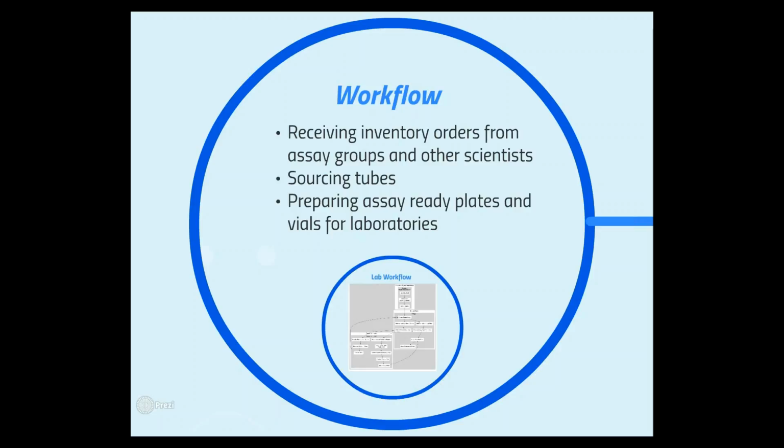We need to make sure we're sourcing the tubes from the right location, so as to optimize the turnaround time for assays, for example, and then make sure that we can prepare assay-ready plates and vials ready for laboratories. And that's true whether we're doing the plate prep within a sample management facility or whether we're doing it in the assay labs, and just ordering up the tubes or vials even.